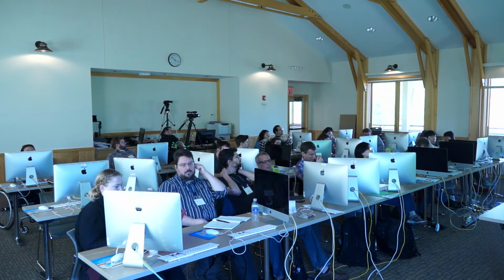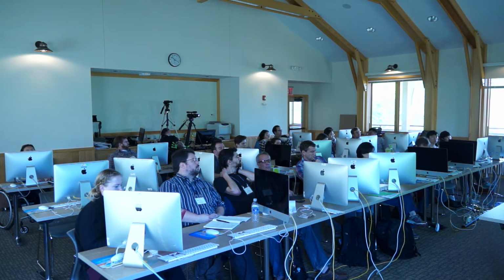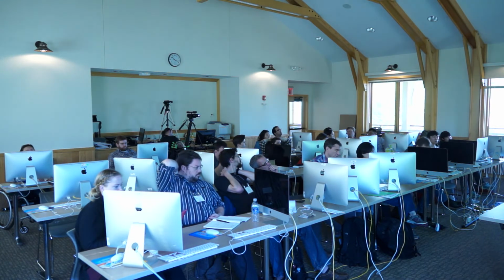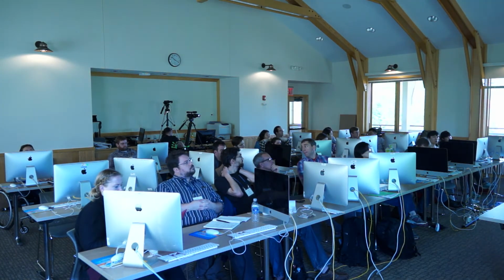So I think on one hand, you're sequencing a longer stretch than the Illumina. Usually you pick one or two regions of that 16S, and part of the problem with identifying organisms with Illumina platforms is that it's such a short segment, you may not have enough information to match it against the databases. So I think that problem is solved by this, but I hadn't seen a similar graph looking at that type of, what is sequenced versus what is expected. So I was just curious to know how it stacks up.